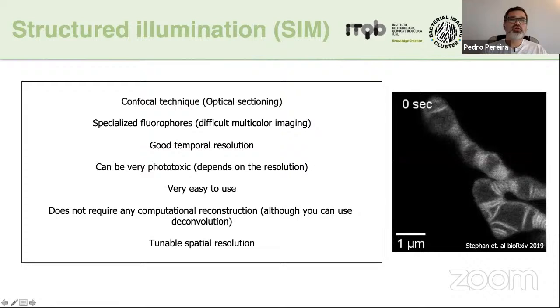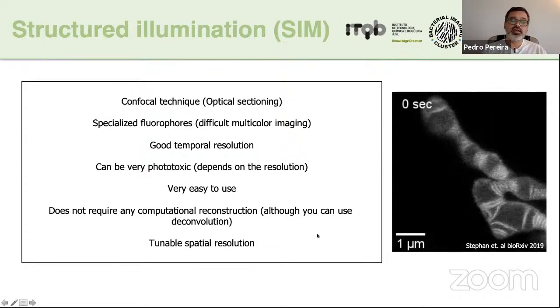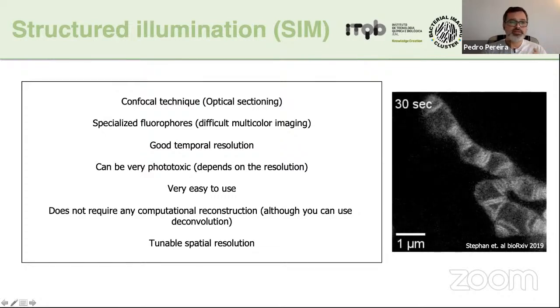Okay, so, whoops, this is not structured illumination, obviously, it's STED. Sorry for that. So STED is a confocal technique. It needs specialized fluorophores because, and we can delve into that in the questions, because to play with this stimulated emission, you have to have a specific type of fluorophores. It can have very good temporal resolution, but it can also be very phototoxic. It does not require any computational reconstruction. And it has this tunable spatial resolution, but again, it comes at a price. So be aware of that.